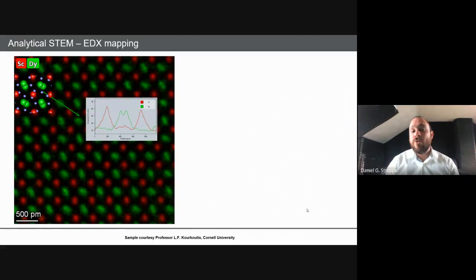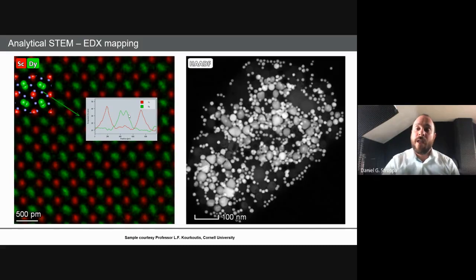But more traditionally, we don't go to this kind of maps. Most of the times, we have a bunch of nanoparticles or a segregation of different materials in layers. And what we want to do is to have chemical mapping localized for the different particles. But this is just to give one idea of what you can do today with the TEM. And here, the question is that it's possible to do this in a quite fast way. One chemical mapping like this takes about 1 minute. So it's much faster because of how we can shape the probe finely and how the detector technology evolved.